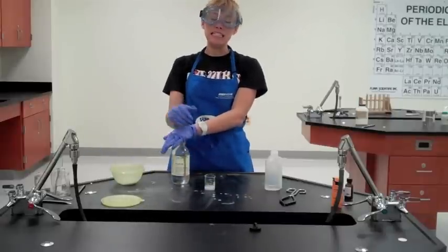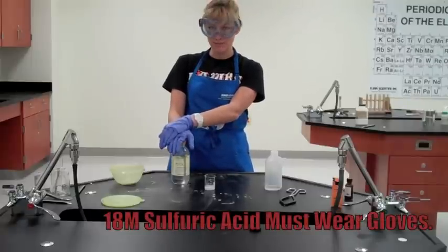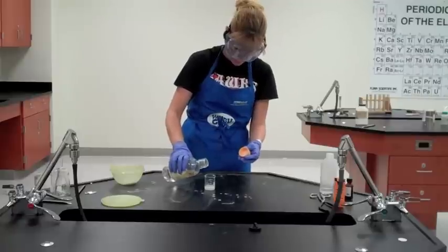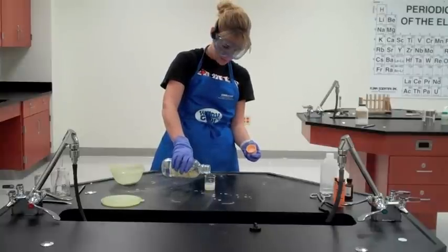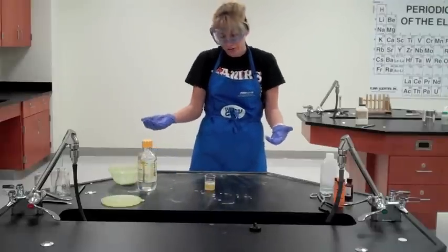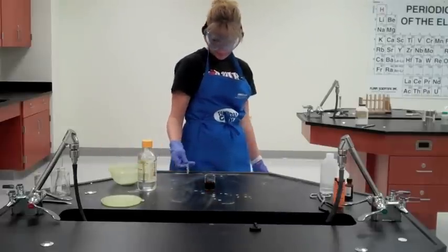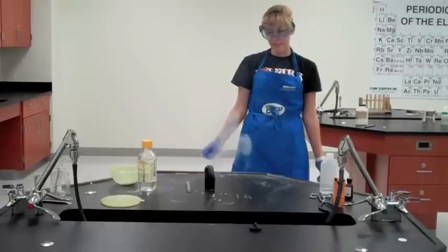This is the dehydration of sucrose — C₁₂H₂₂O₁₁. We're going to use concentrated sulfuric acid to remove the water molecules from the sugar, leaving behind only carbon. Give it just a second. You can see the sugar is starting to cook with the acid, and as it cooks, slowly that water starts to come out. And now you see why we call it the Sugar Snake — it kind of looks like a snake coming up.